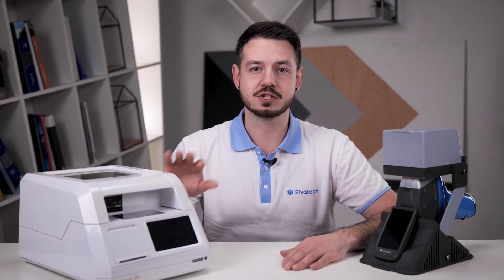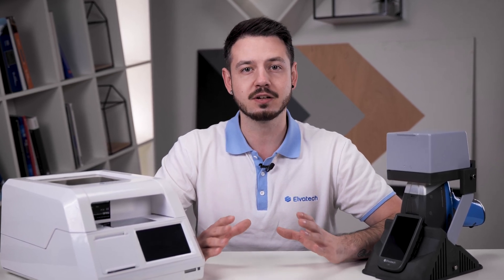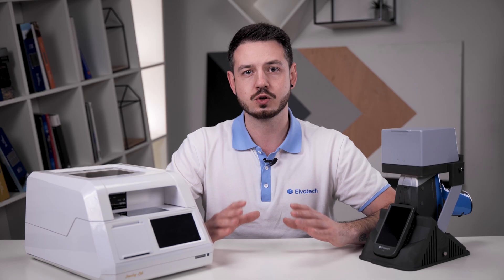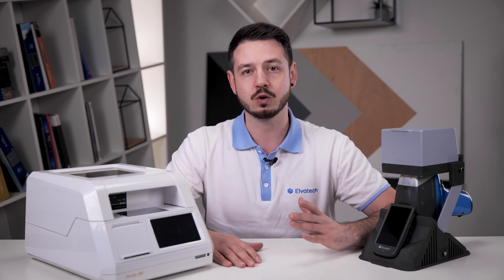The Jewelry Lab is a modern, stylish analyzer designed specially for jewelry showrooms and pawn shops. It has built-in scales and six collimators for flexible and accurate analysis of even the smallest pieces. An interesting feature is the ability to generate a QR code to print labels with information about the analysis results, making your work more organized and professional. The analyzer's built-in camera can also quickly read information from labels or products.